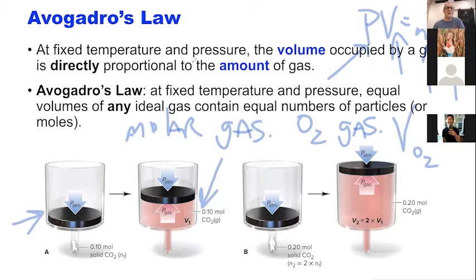What's the pressure going to be? When you're filling up that upside down graduated cylinder with gas, what's going to be the pressure inside the cylinder?